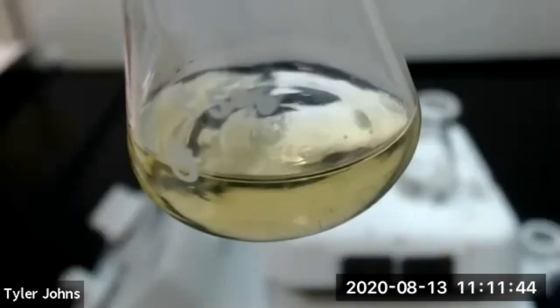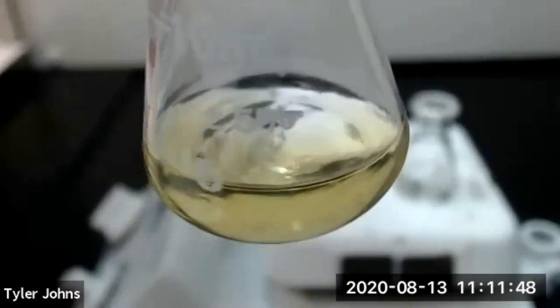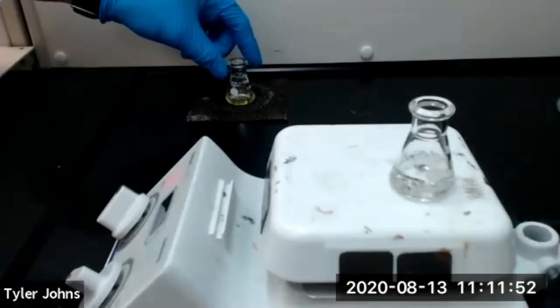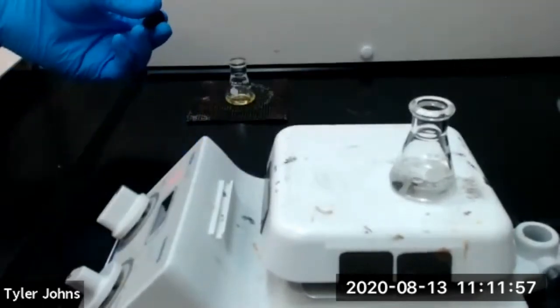Our impure sulfanilamide has now completely dissolved, so we will remove the flask from the heat and allow the flask to cool to room temperature. We'll also stopper our flask.